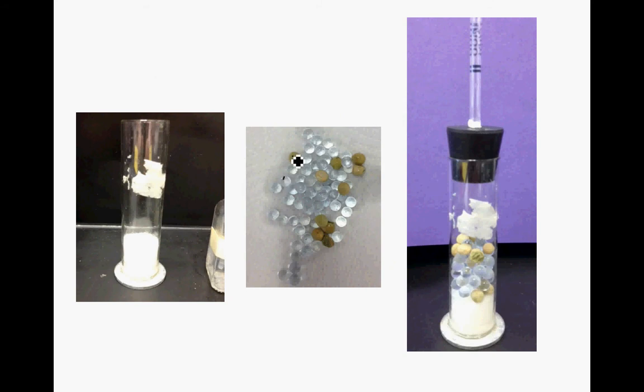Then you're going to quickly take the glass beads and those non-germinated seeds, or the germinated seeds as the case may be, put them on a paper towel, pour the water out in the sink, and then pour these onto a paper towel and blot them dry a little bit. Then you're going to transfer these into your respirometer chamber. So after these are blotted dry, they get added here, and then you put the top on thusly.